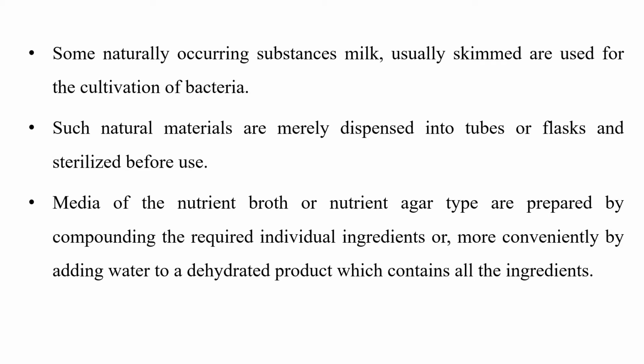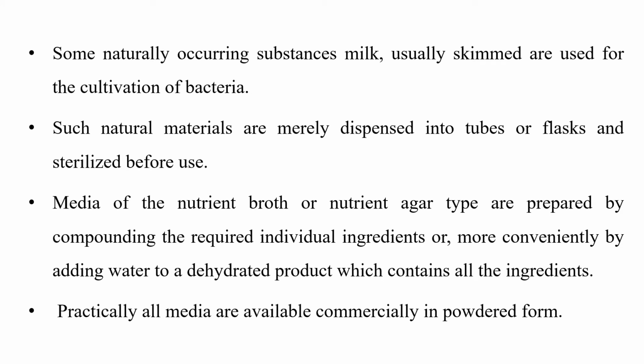By adding a convenient amount of water, we can prepare a medium which acts as an excellent nutrient medium for the growth of microorganisms. The commercially available dehydrated media are available in powdered form.